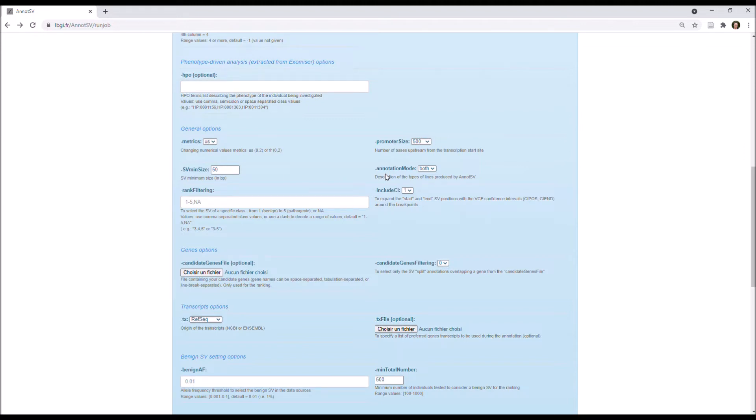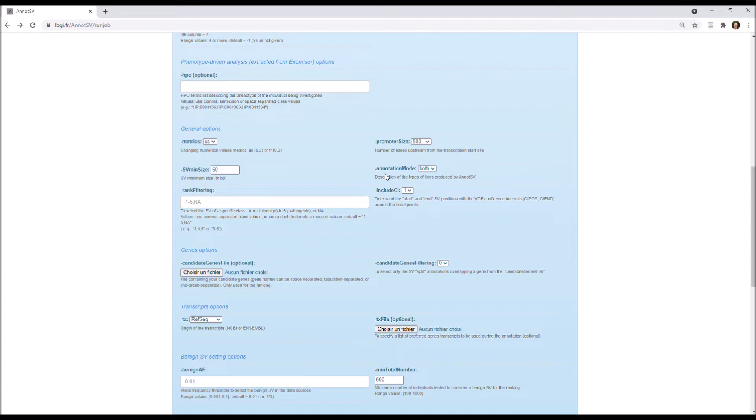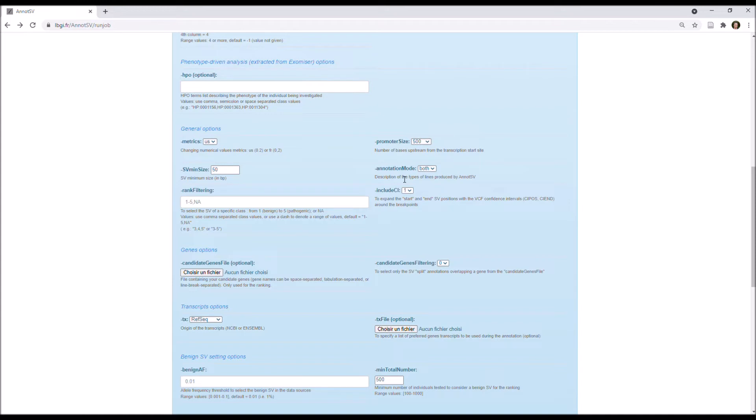Concerning the annotation mode, you need to remember that for each SV, AnnotSV annotates the full length of the SV, so we have full lines, but AnnotSV also annotates all of the overlap genes. And so you have one line for each overlapped gene, and we call this line a split line, I mean a line specific of an overlapped gene, and so with this option, you can choose to report in the output only the full lines, the split lines, or both.